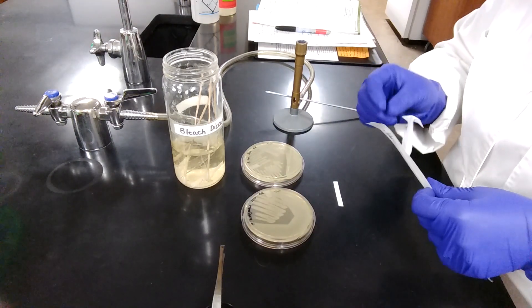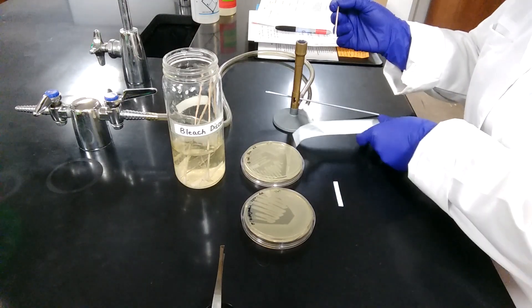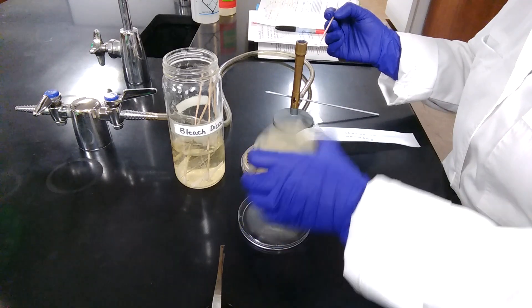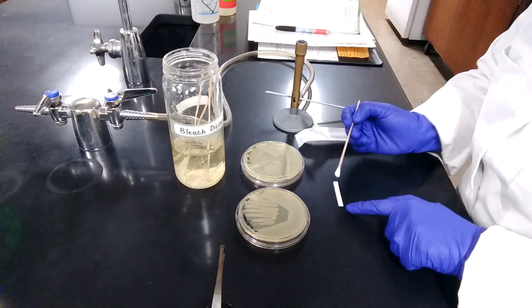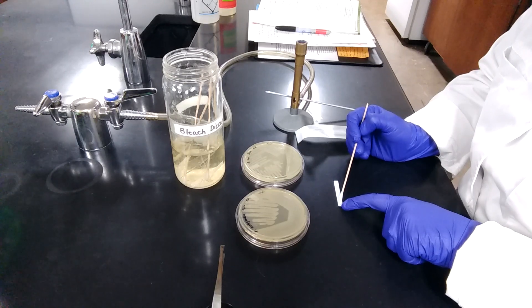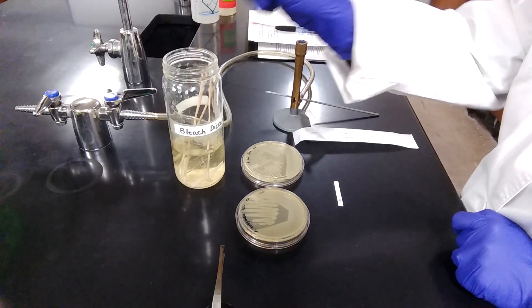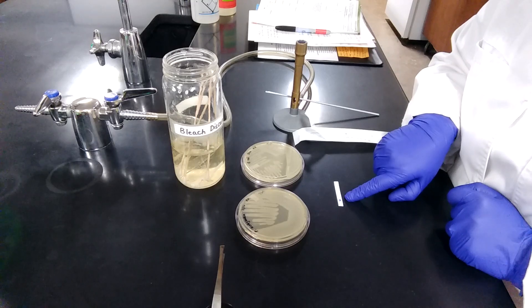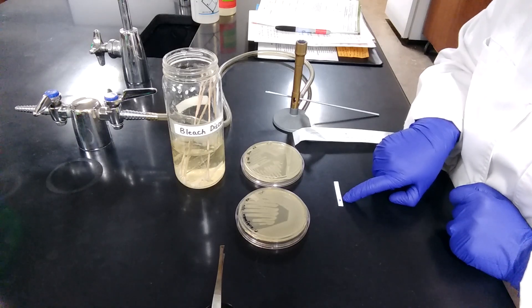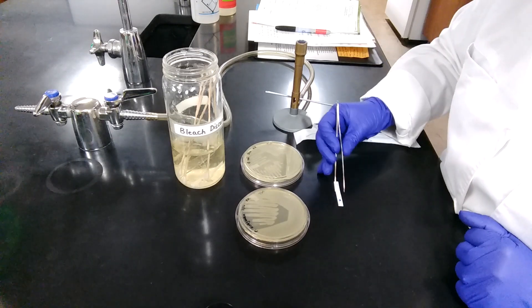Using the other sterile cotton swab, transfer the bacteria onto the paper strip. I'm transferring it to the other side of the paper. And gently dab the culture onto the paper strip and look for a development of deep blue or purple color immediately. And as you can see, this bacterial species has produced a very deep purple color on the paper.